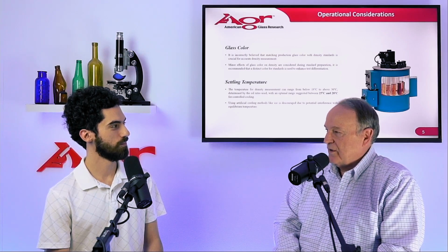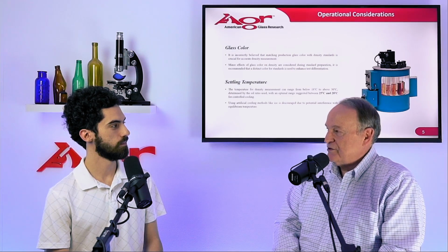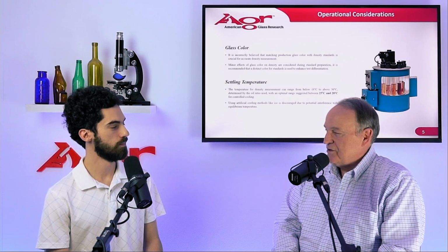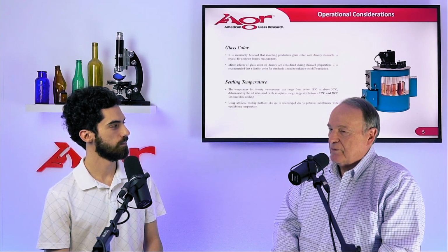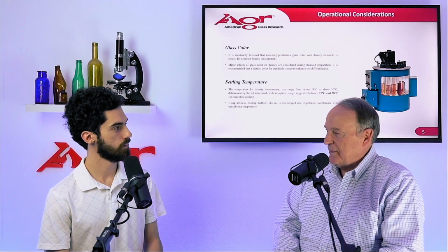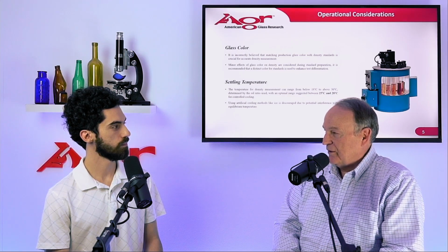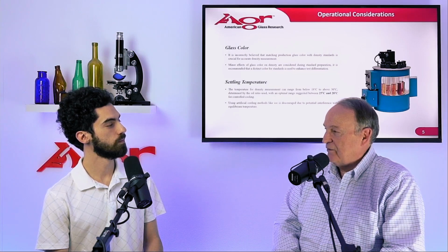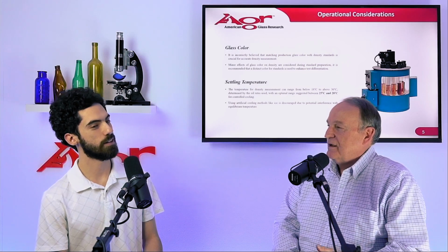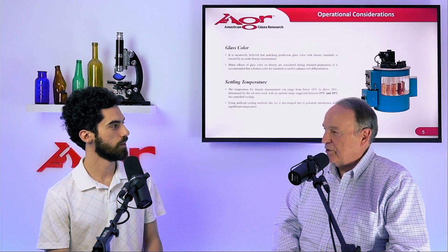One of the things I'd like to emphasize is that some people like to operate in the lower region of the range, which, if you're using city water as your coolant, by the way, we need to talk about that. I forgot to mention there's a heating element in the water bath. There's also a tube in the water bath through which you can run tap water in order to cool that bath down after you do a run so you get prepared to do the next test.